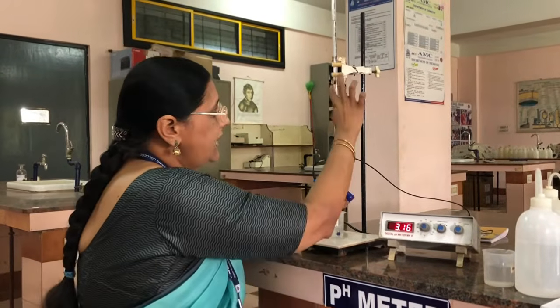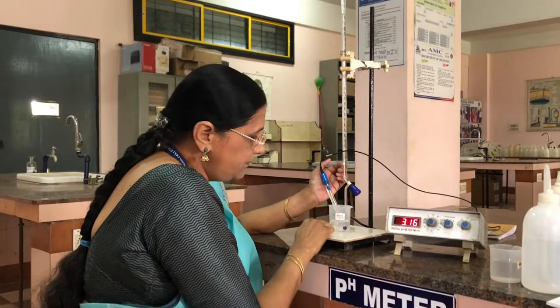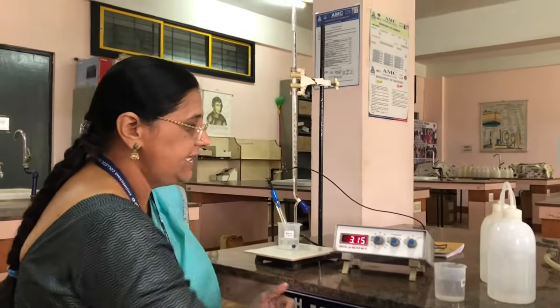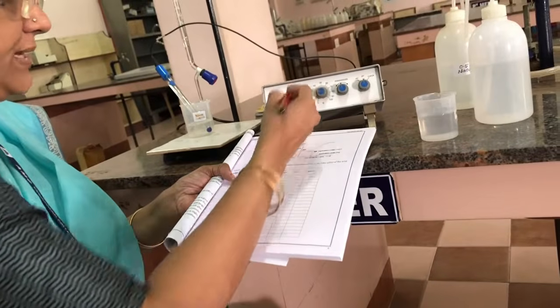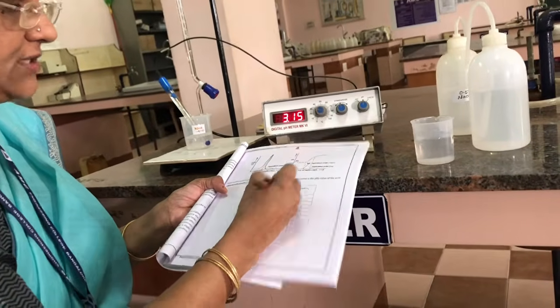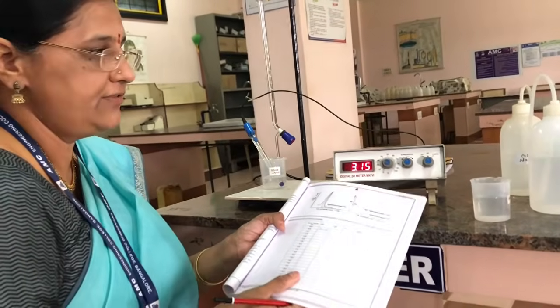Now, without adding sodium hydroxide from the burette, we have to note down the pH of the weak acid solution, which is showing as 3.16. There is a tabular column in this. All of you take out your manual books and note down the pH of the solution without adding sodium hydroxide. It is showing as 3.15. Please make a note of 3.15 without adding sodium hydroxide from the burette.